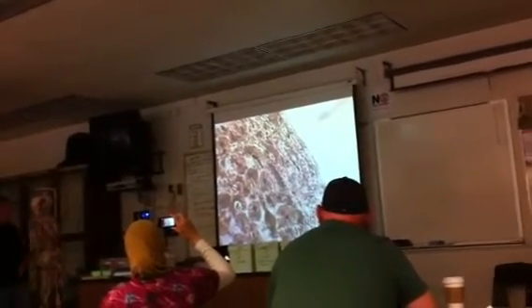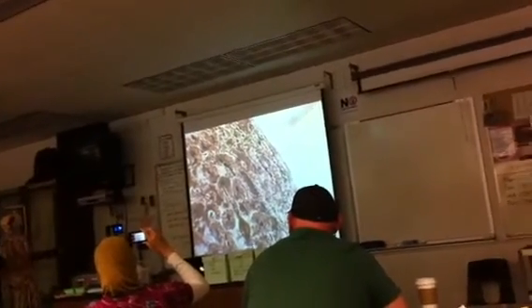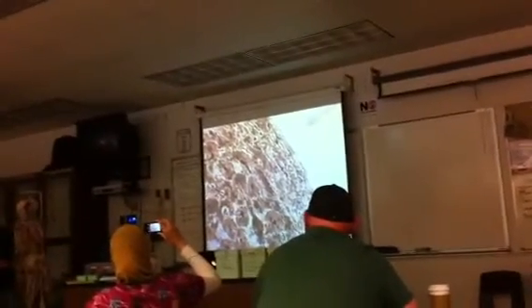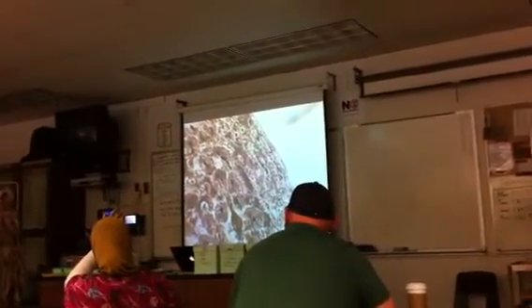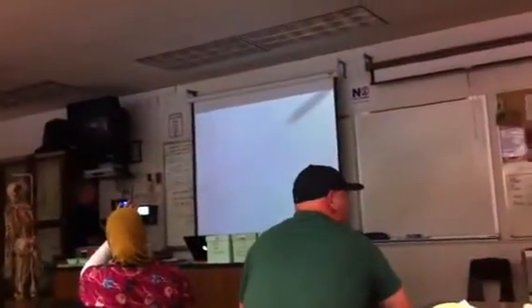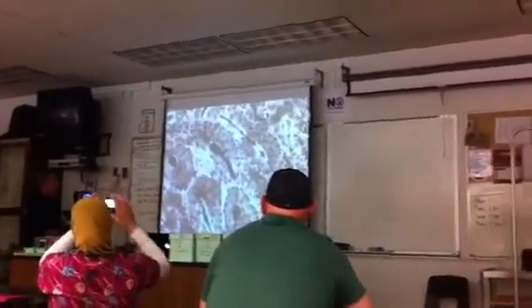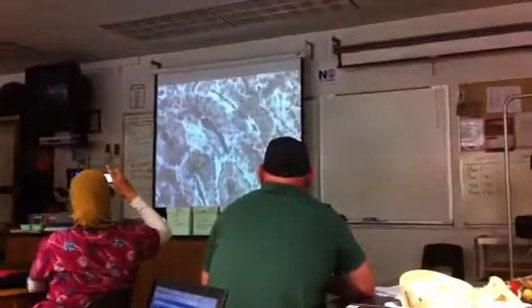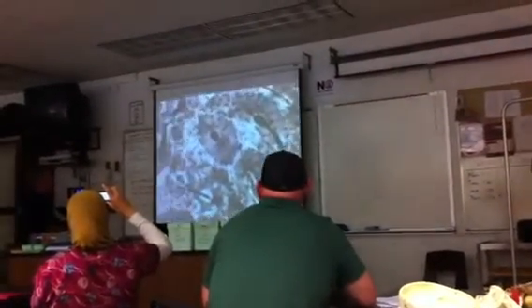We need a little bit higher magnification. So I have to point out the lamellae and, of course, the little black dots, even at this low magnification. I know you know the little black dots are the osteocytes. So anyway, let me go around to the next power and have a look. Okay, here we go. This is good.